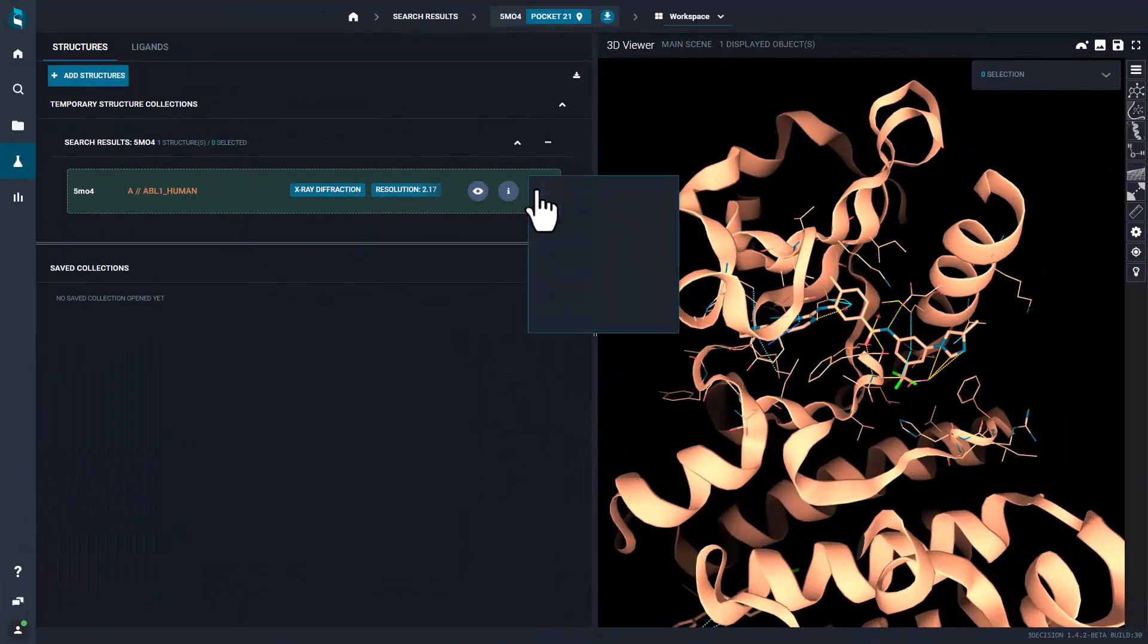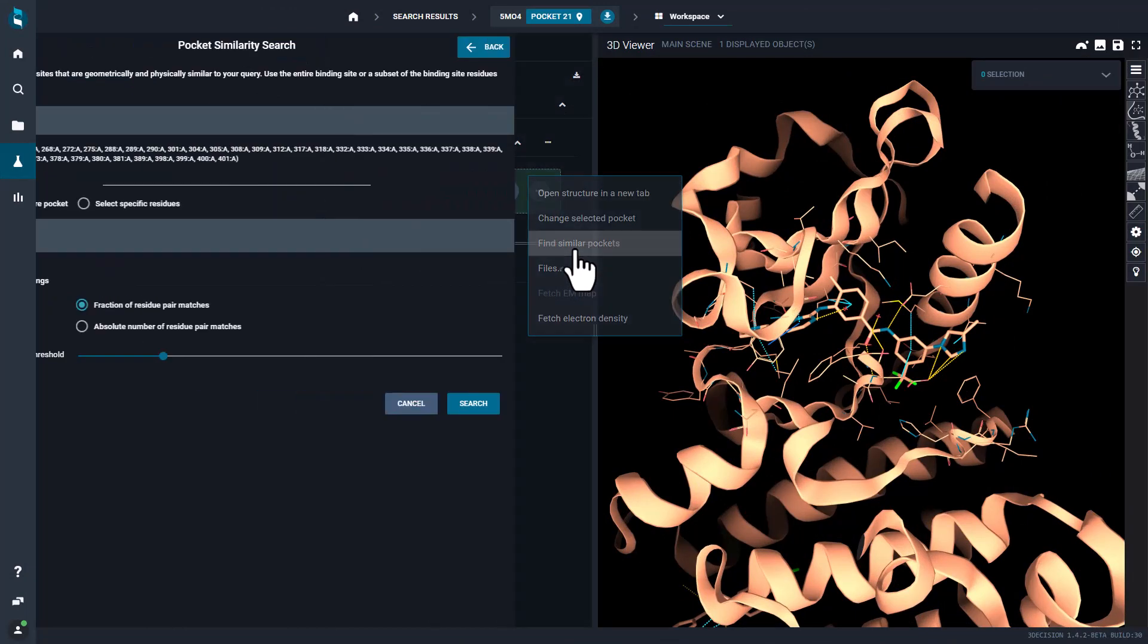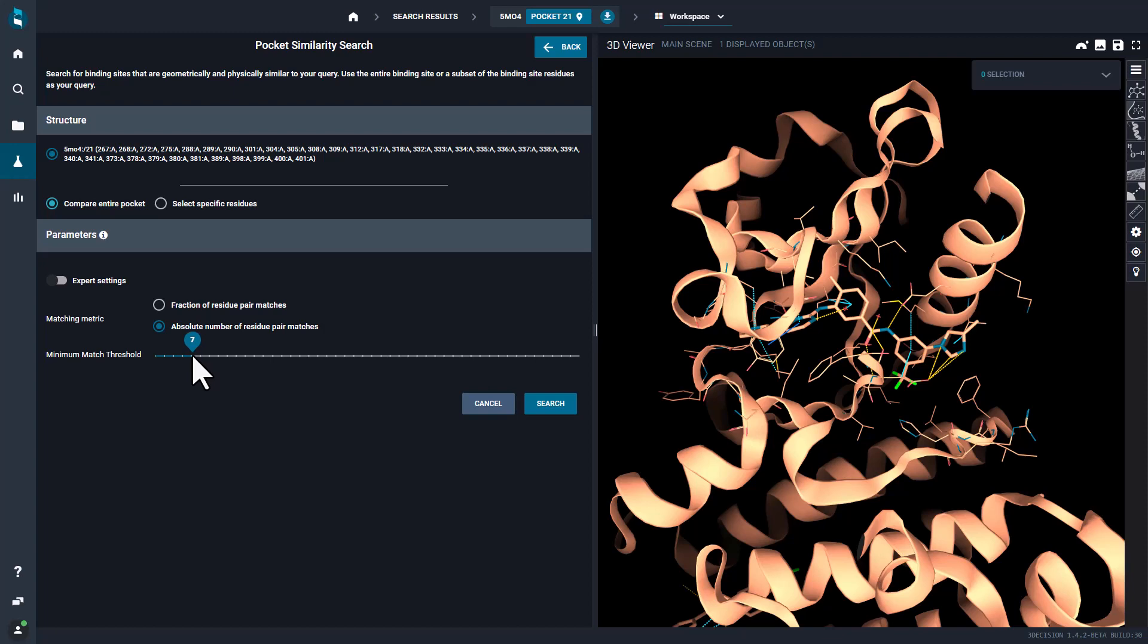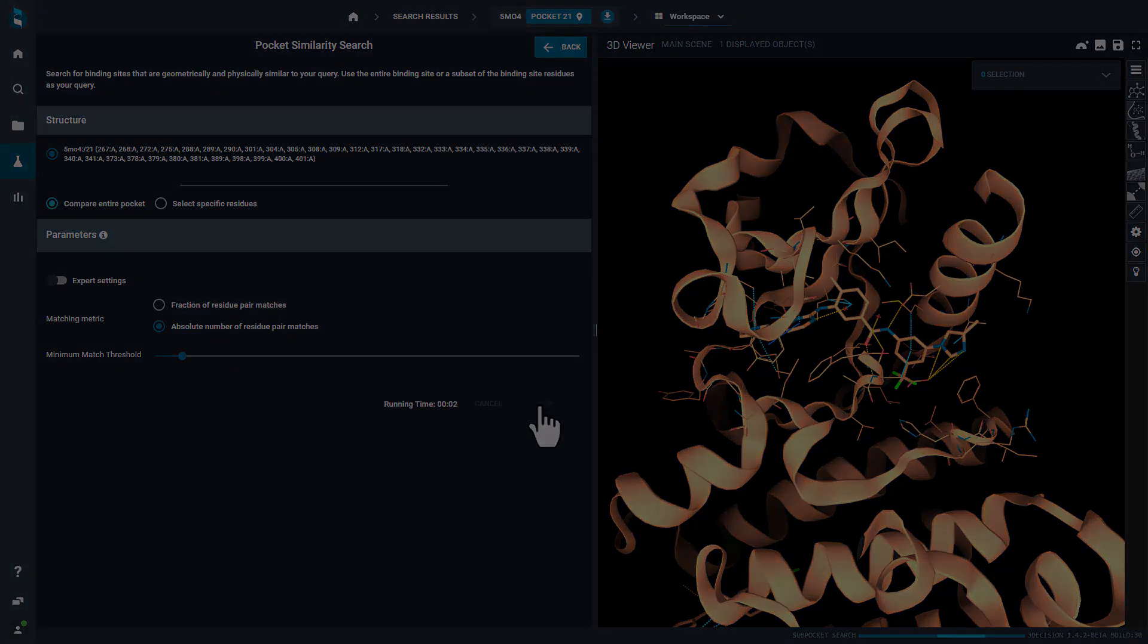In addition, the pharmacophoric features for each pocket are indexed in 3Decision. This allows you to run advanced analytics such as binding site comparisons, assess off targets, and get ideas for new designs.